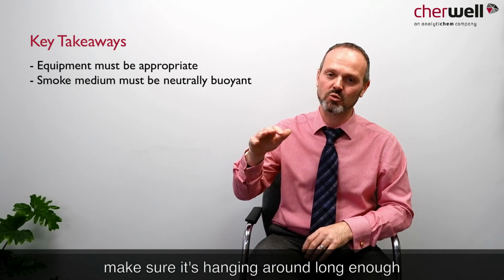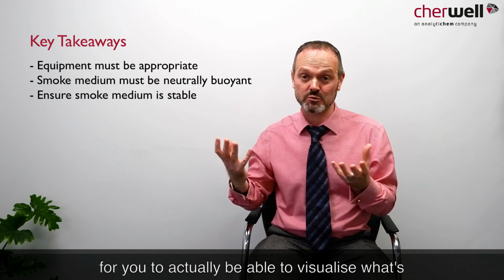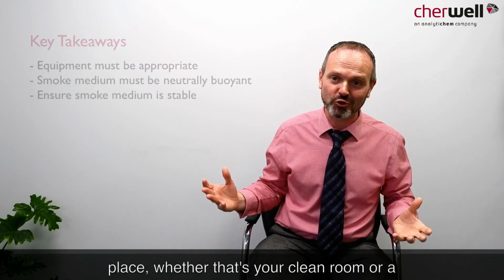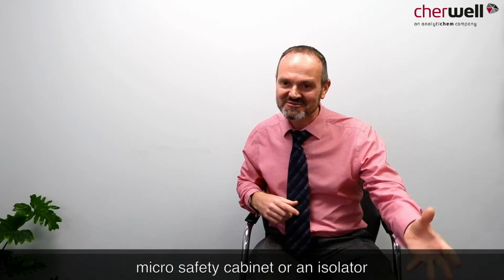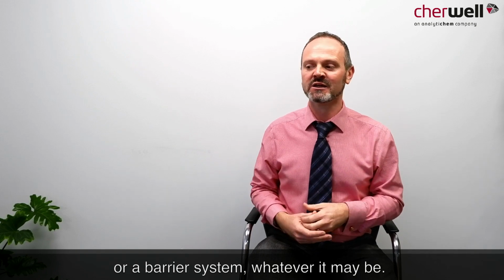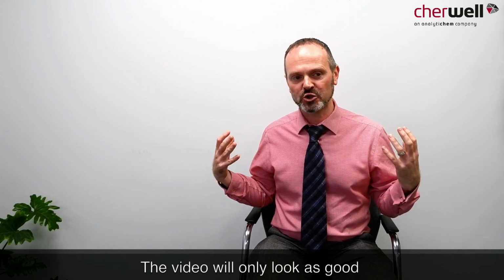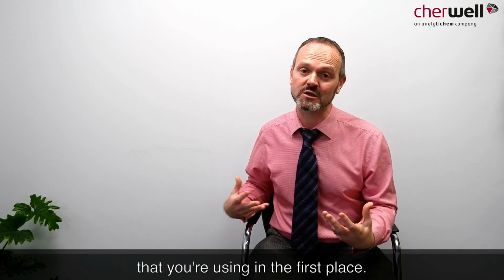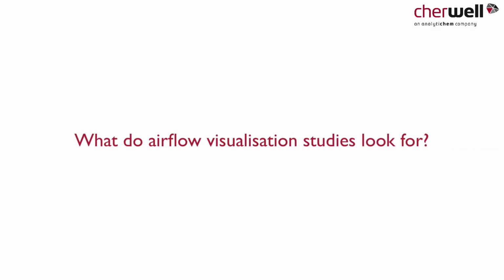And make sure it's stable, hanging around long enough for you to visualize what's going on in your environment, whether that's your clean room or a microbiological safety cabinet or an isolator or a barrier system, whatever it may be. The video will only look as good as the equipment and the smoke medium that you're using in the first place.